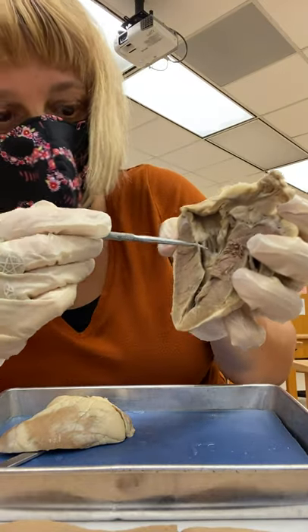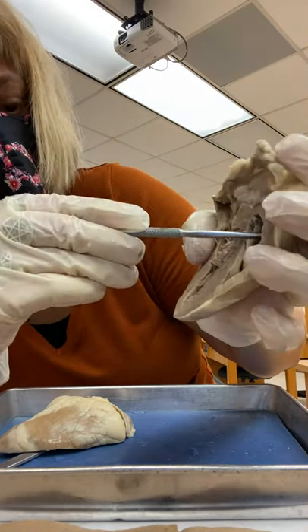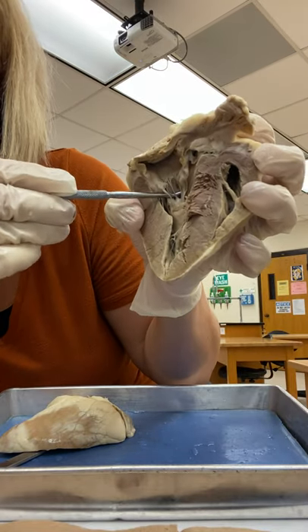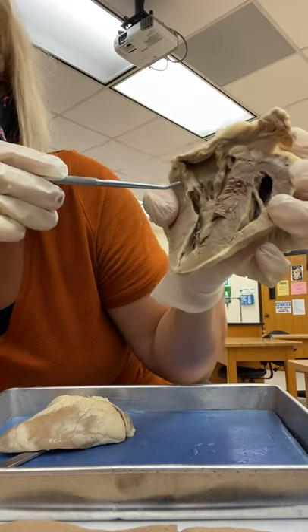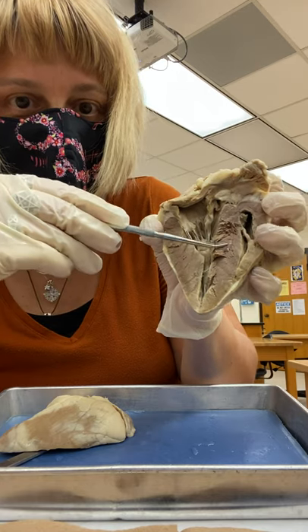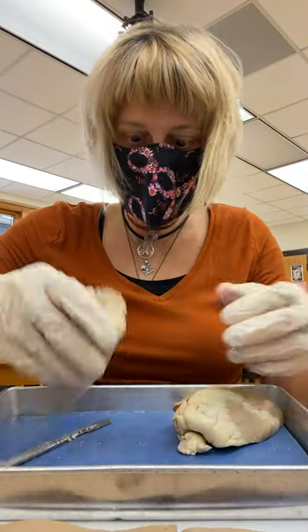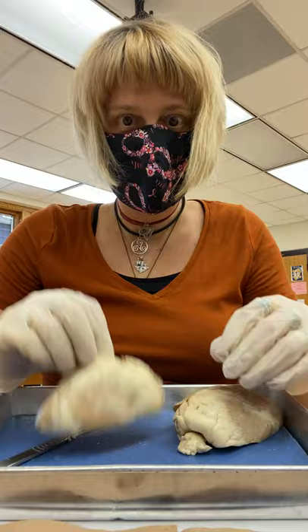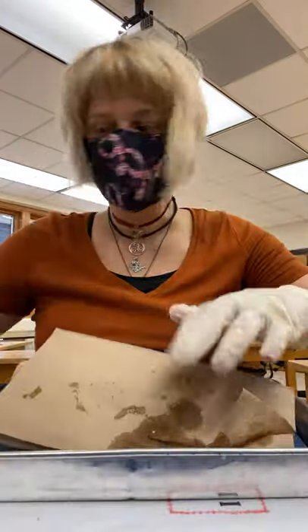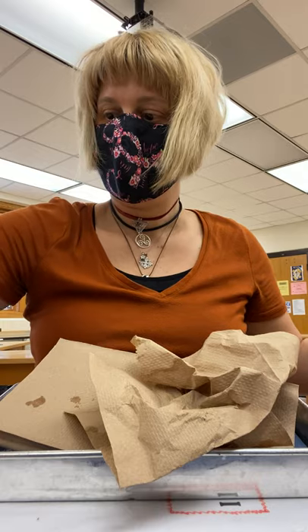I just want to make sure you're able to identify the valves. You should be able to see the chordae tendineae — those structures right there. And there's the valves — that's the most interesting thing you should be able to see. Look at this left ventricle, how thick it is compared to the right ventricle — very different. I already showed you all the great vessels. So let's go over now and go over the lab model.